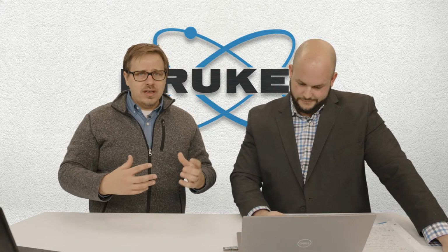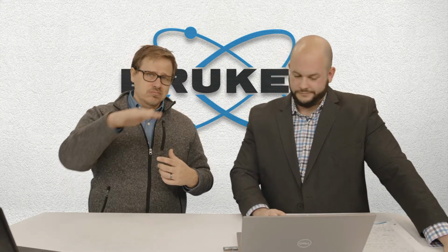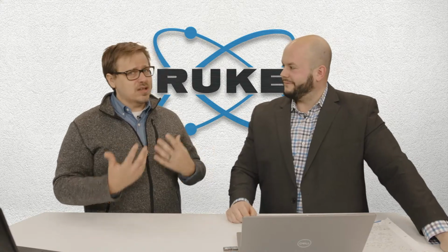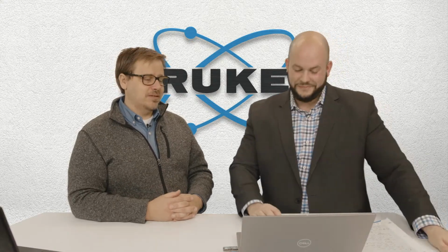But unfortunately, as we add different variables in, that can create some solutions that do have a minimum, but they're not the global minimum. They're not the best solution. So we do have to be careful. If you turn on too many things, you're going to get more of those possible local minima, and that's going to be a solution that is kind of a niche thing, but not the right solution. So start with some fixed values, and then you're going to be better off. Yeah, 100%. And you have to think about what's going to be realistic.